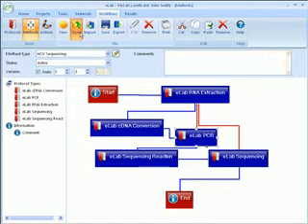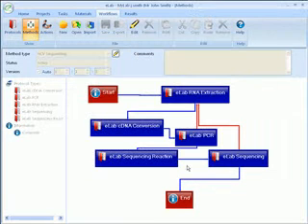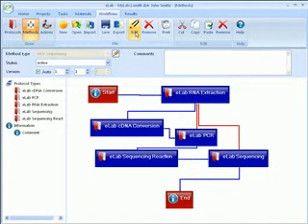To view or edit the method in the future, click on the Open button and select it. To edit, click on the Edit button. Again, it is a good idea to change the version number if you are modifying an existing method. Once a method has been created, you can create a project that uses these rules to take a batch of samples from plasma to a sequenced product.